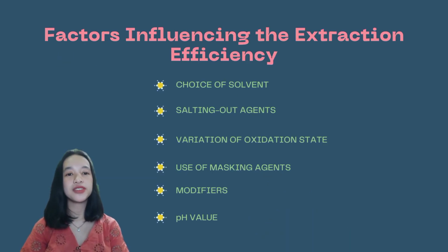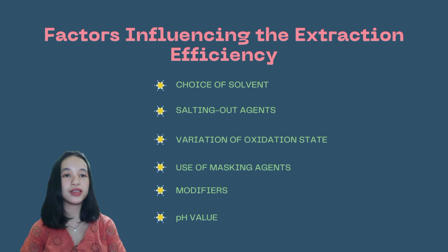The primary requirement of solvent extraction for separation or removal purposes is a high distribution ratio of the solute of interest between the two liquid phases. It is useful to employ a number of different techniques for enhancing the distribution ratio. Some of the factors which affect the distribution of the solute of interest are the following: choice of solvent, salting out agents, variation of oxidation state, use of masking agents, modifiers, and lastly the pH value.